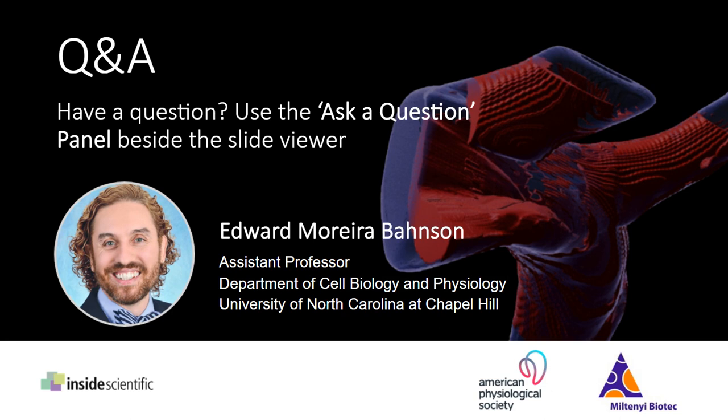Can this method be used for small vessels, for example, in the brain? That has a very quick answer, yes. We can address the next one. There's vasculature in the brain with the LSFM. There's a lot of literature out there.